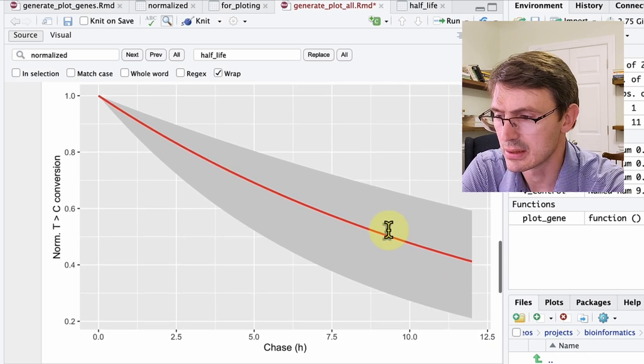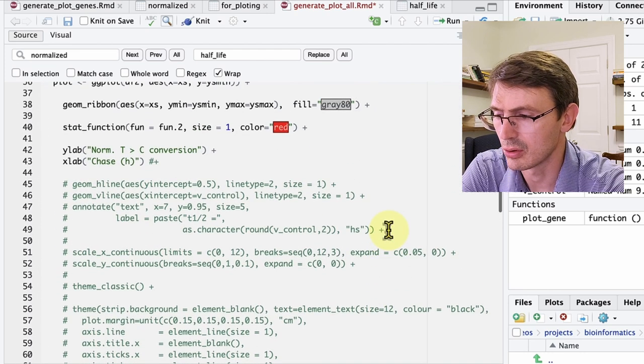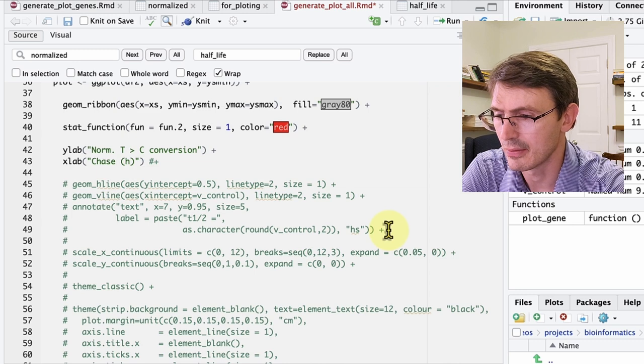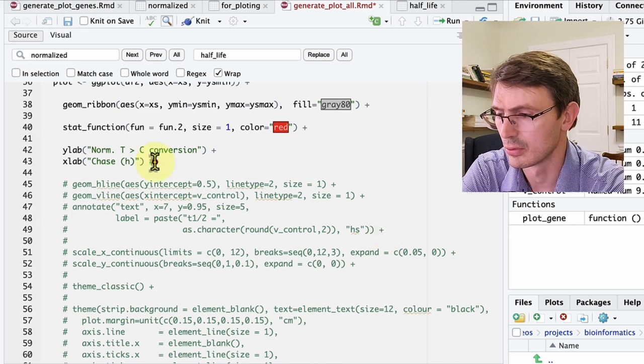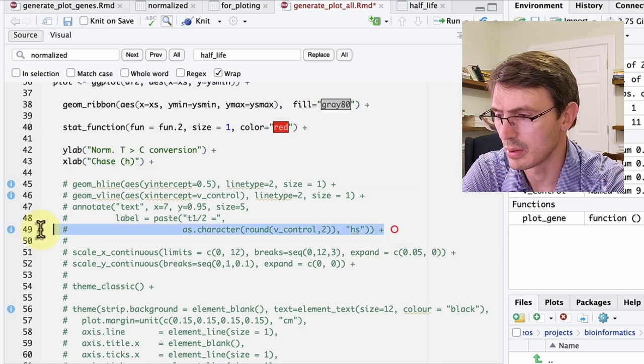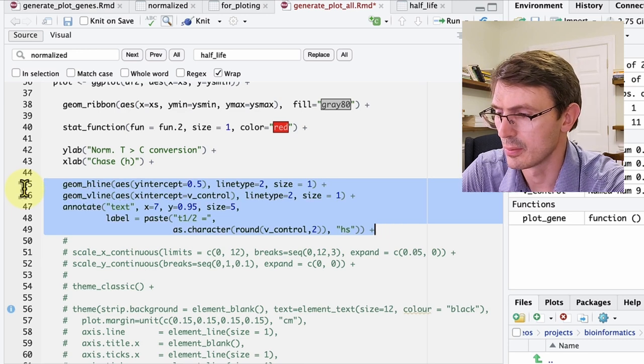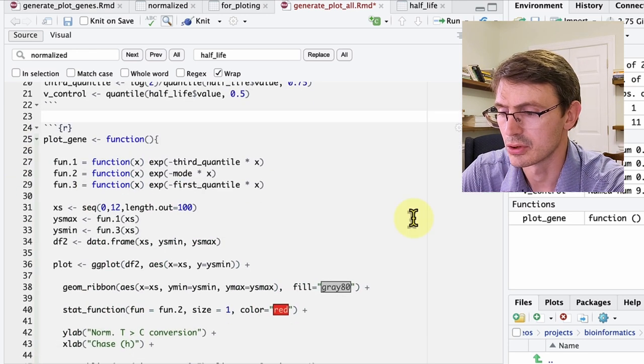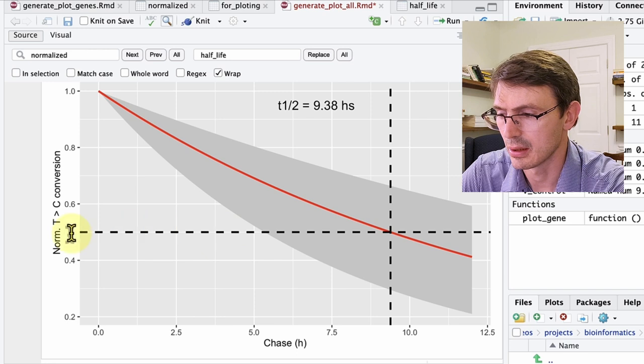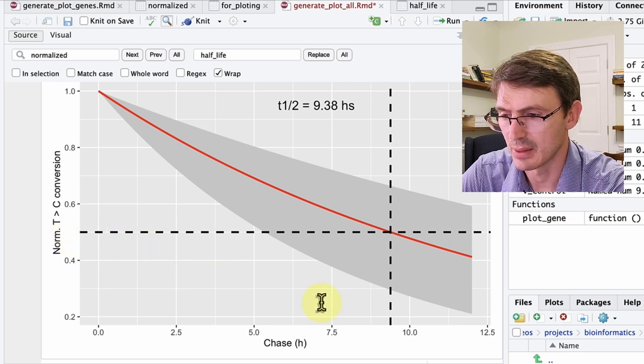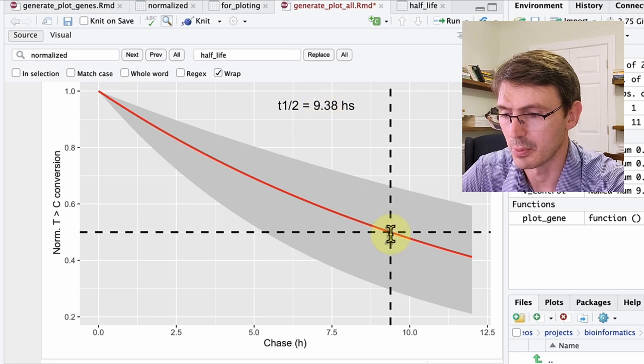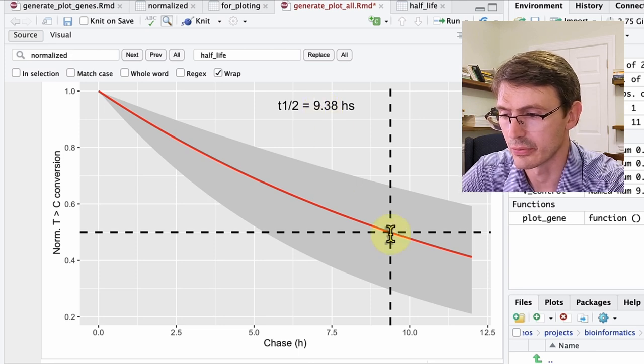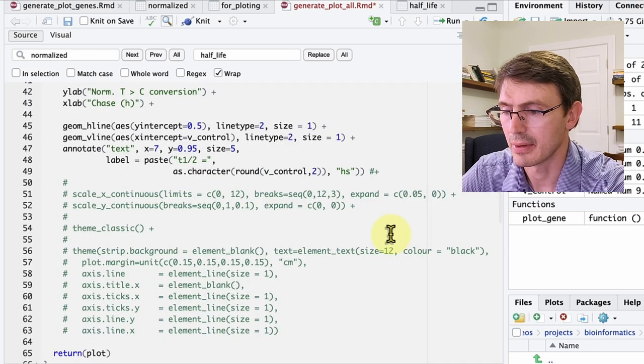Okay, so this is better, but we can also add the half-life value for the whole population to have it as a reference. And we will do this with this geom h line and v lines. So we launch that and we have the plot here at 0.5 where it intercepts and it gives you the half-life of 9.3 for the population. And that's good just to have a sense of where is the half-life.